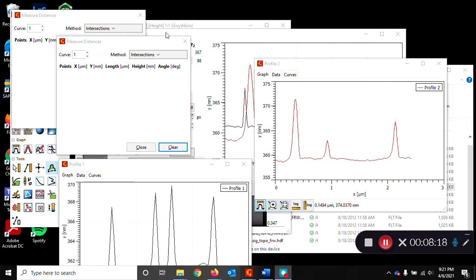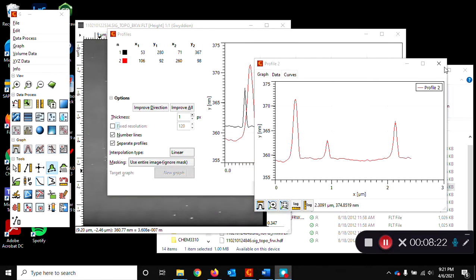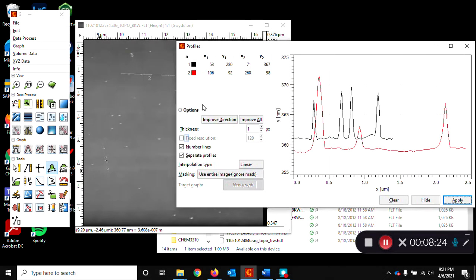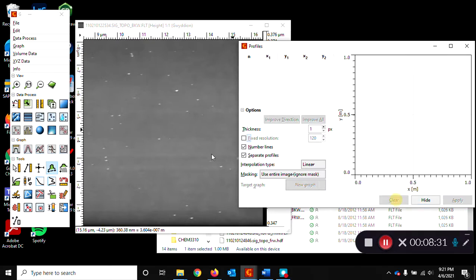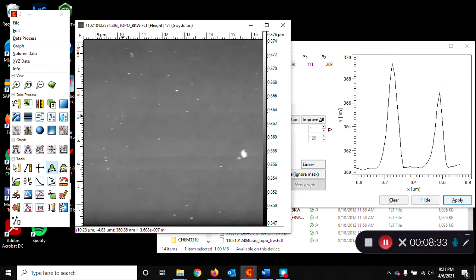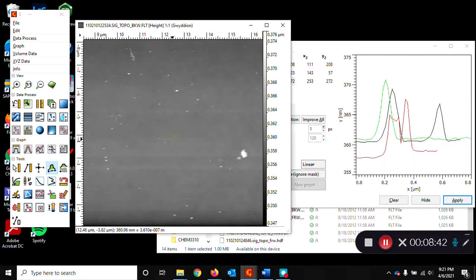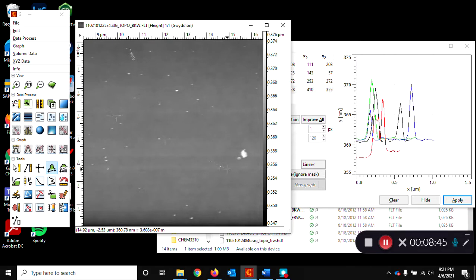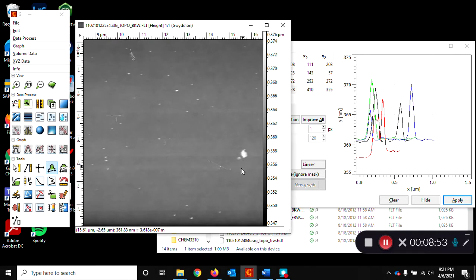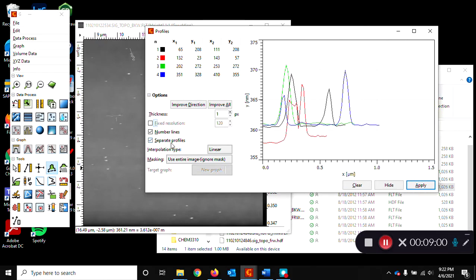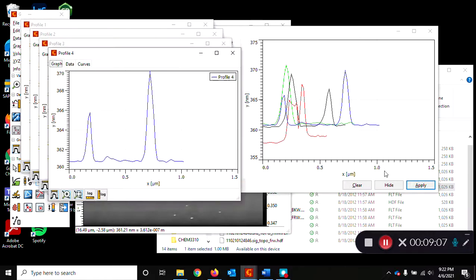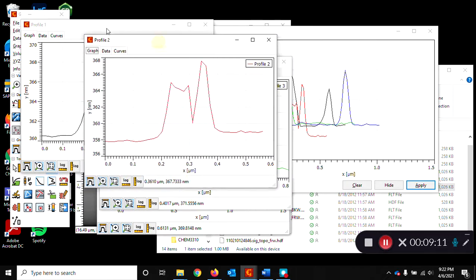So once you've measured the peaks on these profile curves, those are actually the heights of these spots, and you just can measure more. I guess you can measure as many as you can stand in one pass to keep track of where you already measured. Clearly, this isn't a nanoparticle. It's an agglomeration of something. Okay, so I drew a few more lines, and remember, if you click the box separate profiles, then when you apply, you'll make a different graph, a different curve for each profile line.